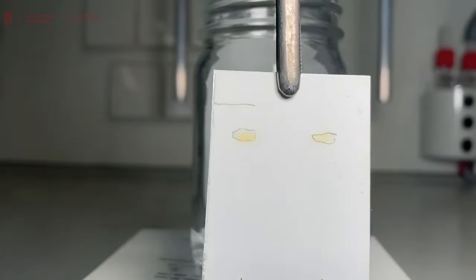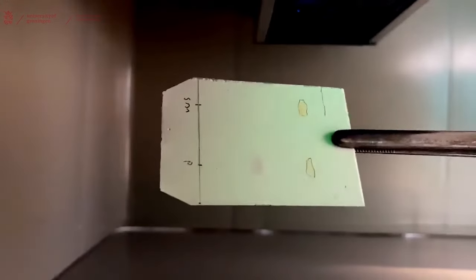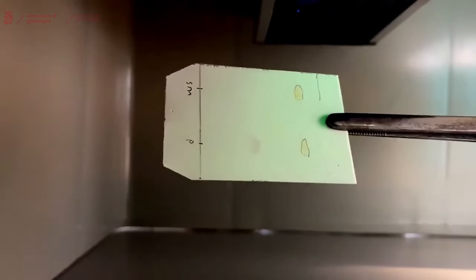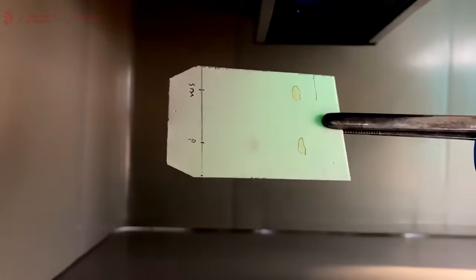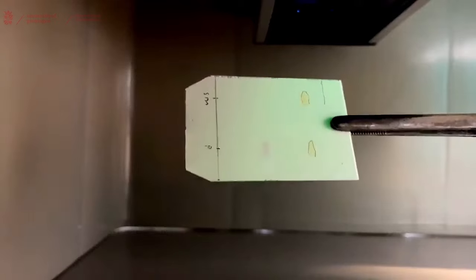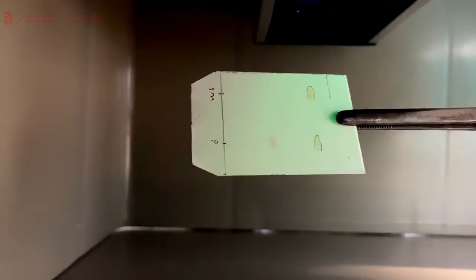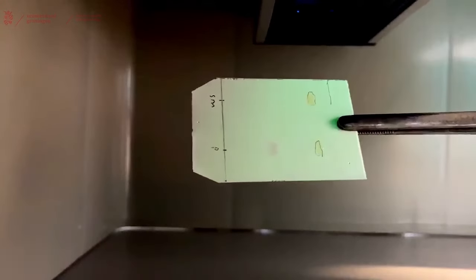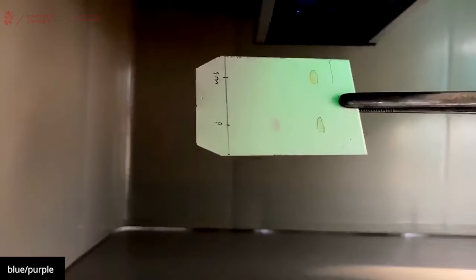Now we circled both spots. Now we'll use different techniques to visualize what else is on the TLC plate. One technique to visualize spots that are not visible in normal light is to use UV light. The TLC plate is covered with a fluorescent coating that fluoresces green under 254 nanometers. Other compounds that absorb UV light might show up as different colors, as is the case in our TLC where you see a blue spot halfway through the TLC plate.